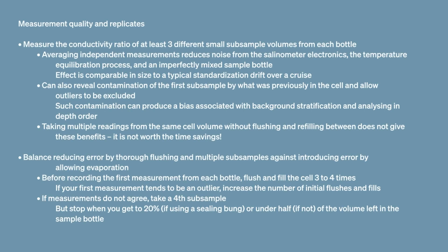And then we can measure and record a third sample from this bottle, again checking the cell is completely filled, the bath is stabilized before we switch to read, and the reading displayed is stable as well. To decrease uncertainty, you can repeat for a fourth sample from the same bottle as long as it's over 20% full. Now that we have recorded the conductivity readings for 3 or 4 volumes drawn from a newly opened bottle of standard seawater, we can start with our ocean samples.